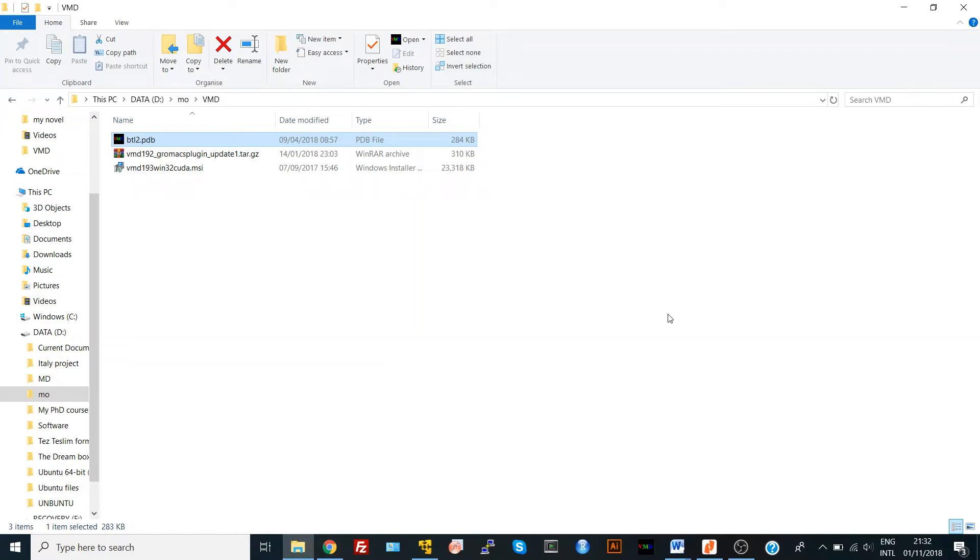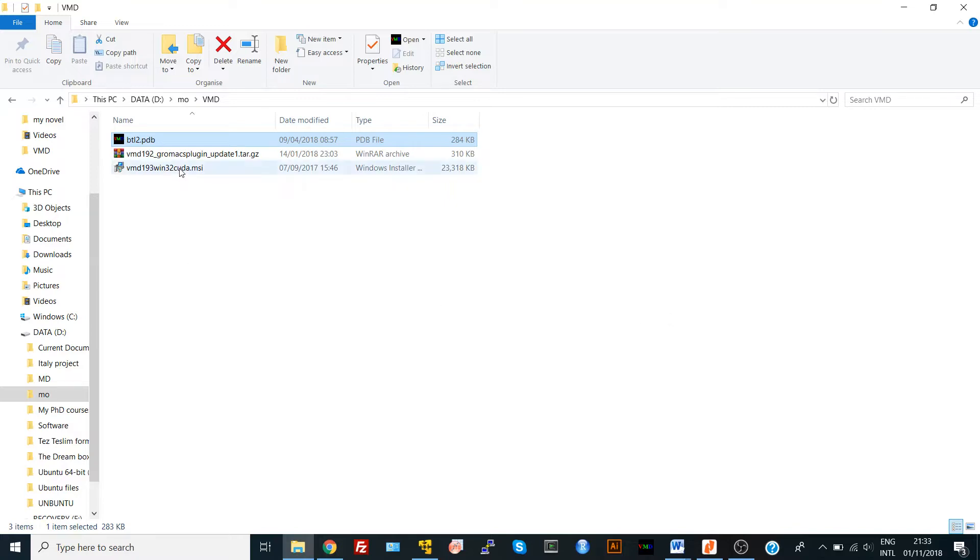Hi everyone, in this video we'll talk about the reasons for getting an error during generating a protein structure file in VMD. One of the most common reasons for this is that you do not run your program as administrator, so it doesn't have access or privilege to access different files on your computer.